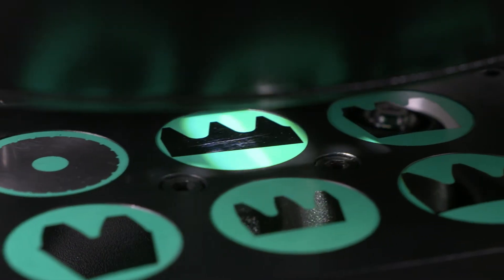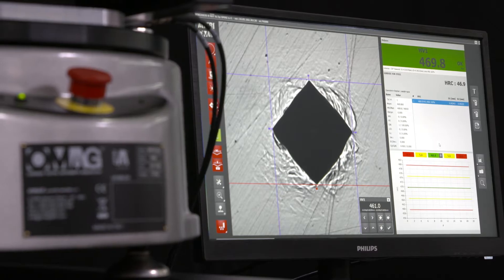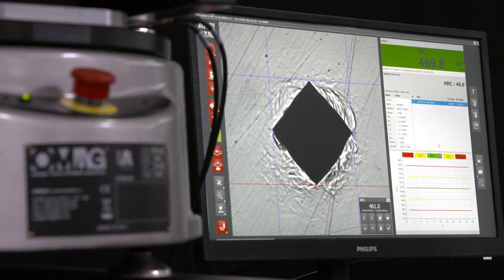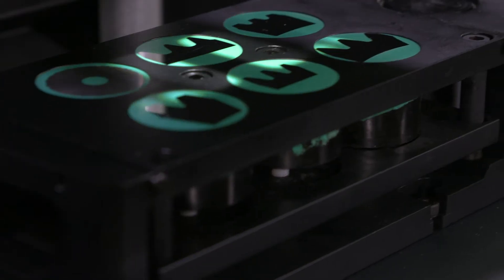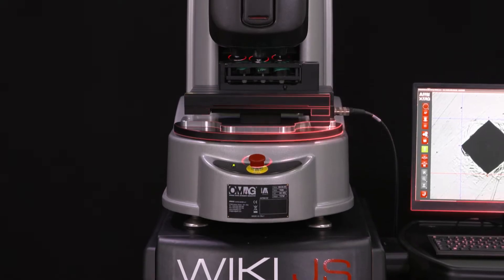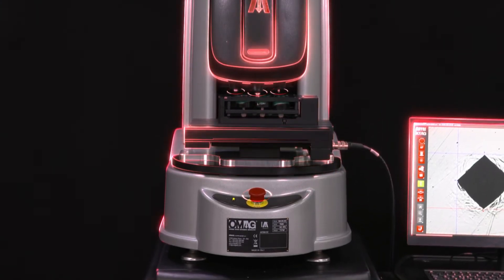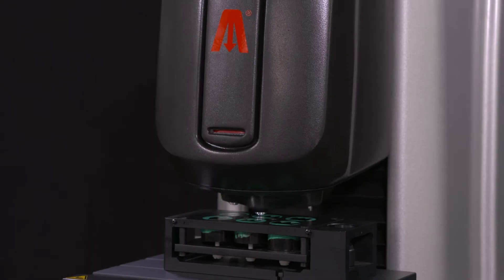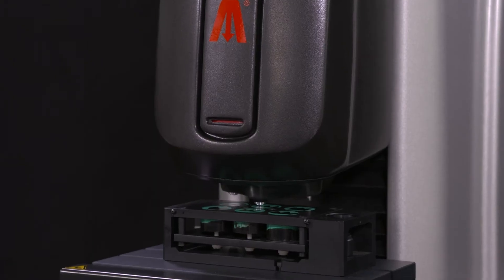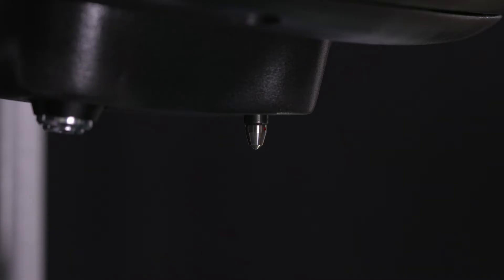The dedicated software is extremely intuitive. The AFRI WIKI 200 JS is equipped with AFRI patented technology with load cells controlled by a closed-loop system.